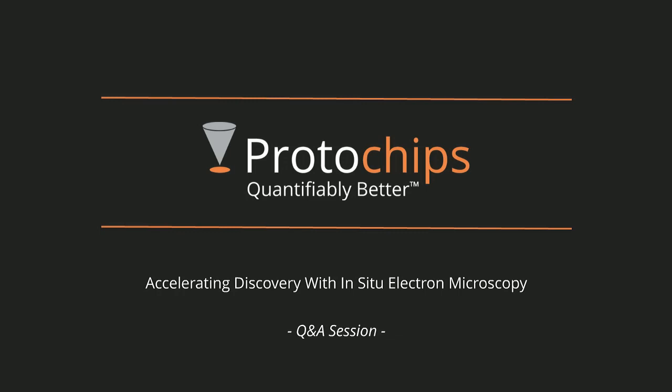So the Clarity software comes with Fusion, and if anyone has any questions about that software or just in general how to run in situ experiments, feel free to email me. I think I left my email on my first slide, but just send me an email if you have questions about software or running experiments.